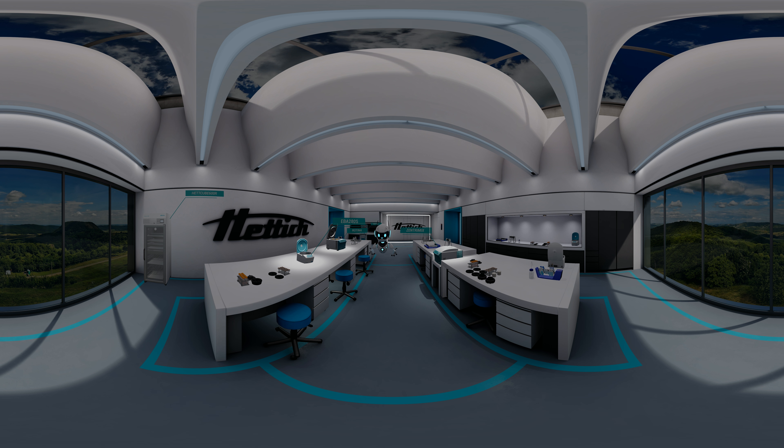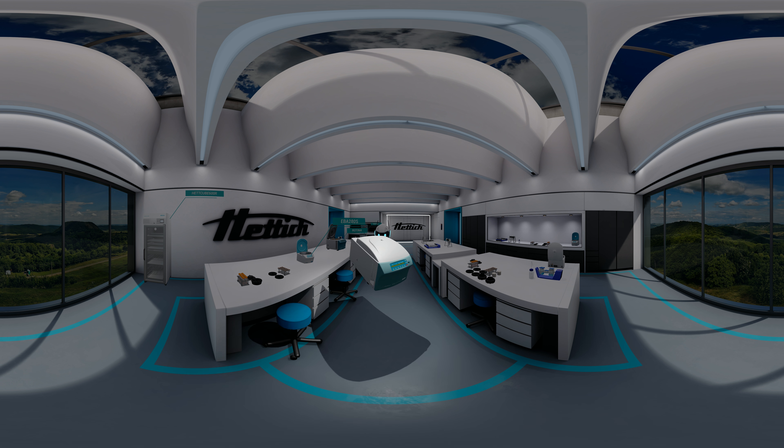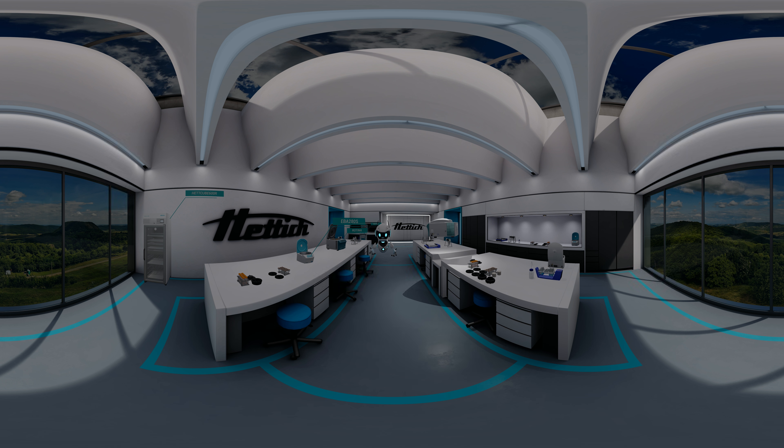Welcome to the Hetich Lab. I am pleased to introduce the Zentromix 380R, a newly developed dual centrifuge. By using the unique principle of dual centrifugation, the Zentromix 380R is the only centrifuge which is able to homogenize, mix, smash, or grind. And, of course, it can be used as a normal lab centrifuge as well. Let's have a closer look at the new technique together. This exhibition will introduce you to the principles and hardware details of the new Zentromix.